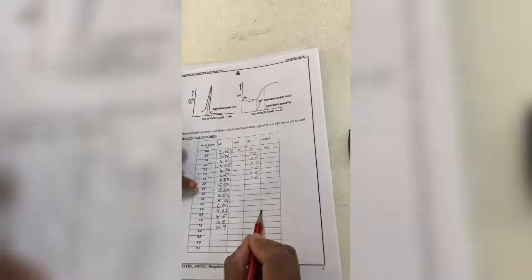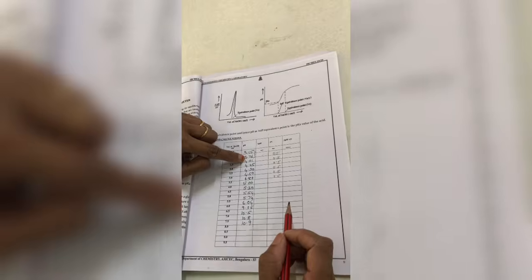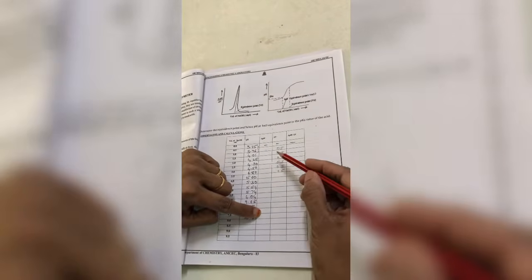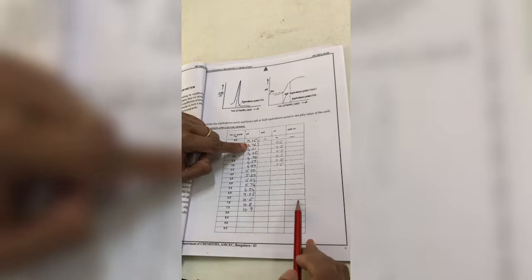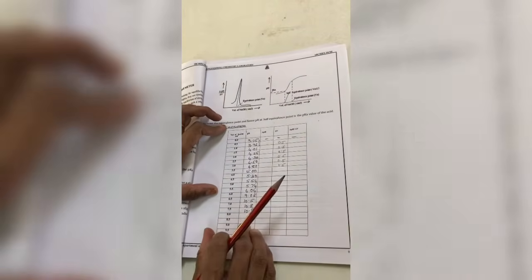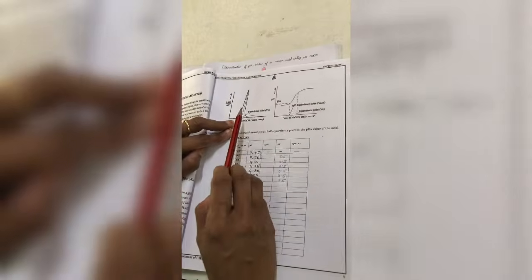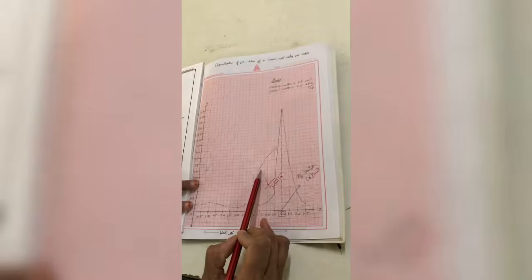sodium hydroxide. So after filling this column, finding out the difference in the pH of previous reading and present reading, you note down the values here. And the delta V is always 0.5. And then you calculate delta pH by delta V here. So once you fill this table ready, now you have to take out 2 graph sheets to plot the graphs to find out the pKa. So take the first graph. So first graph, you will be taking the graph sheet, y-axis and x-axis.